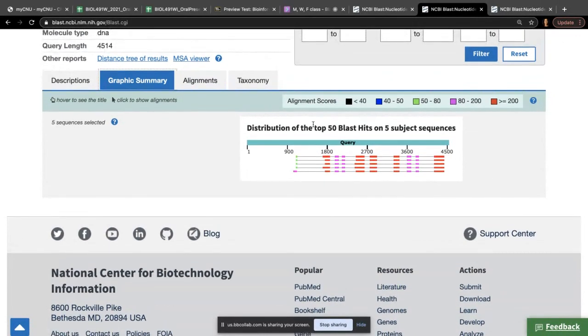And how many genes are there? So this is one gene. It's all linked by these lines that could signify introns of that gene. The boxes will be your exons because they are sequences from your genomic sequence that ended up in the mRNA. And when I say the answer is 1, it's because in this part of my genomic sequence, there's one gene encoded.